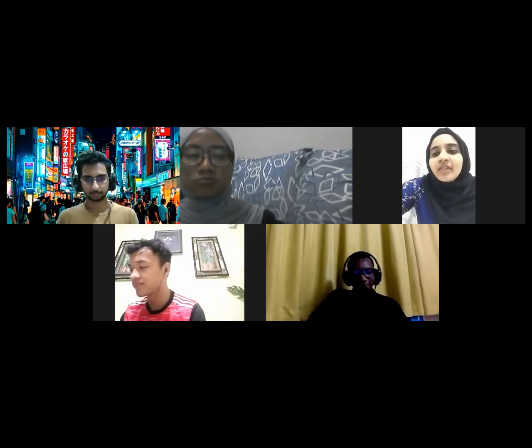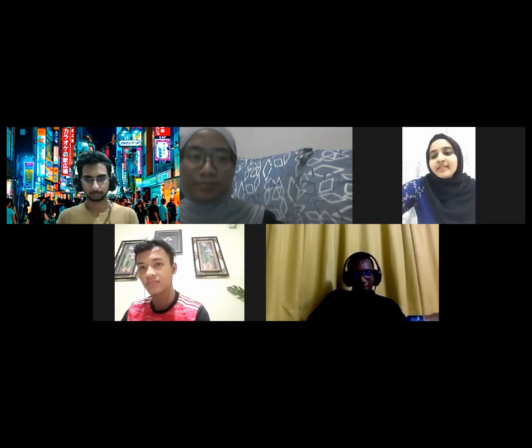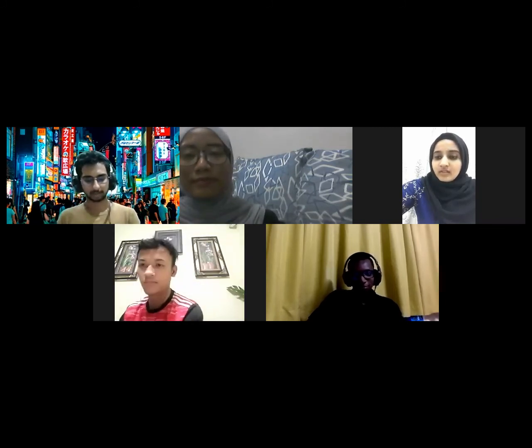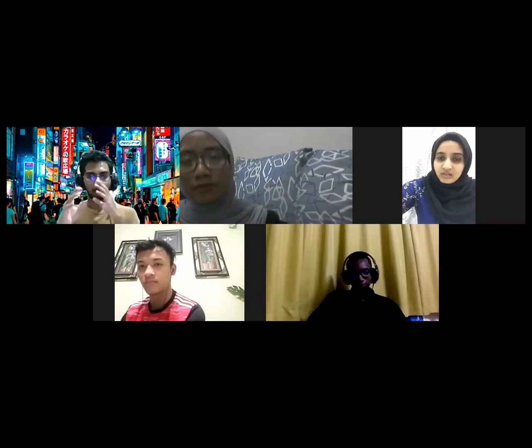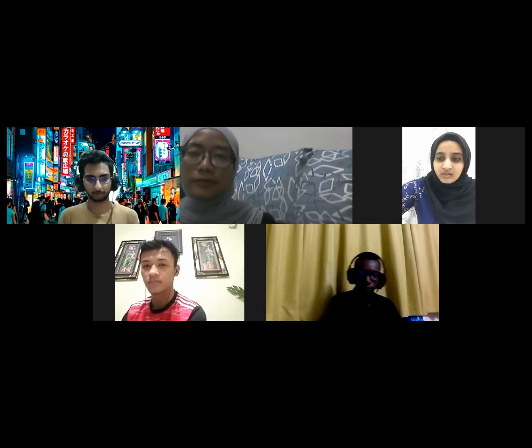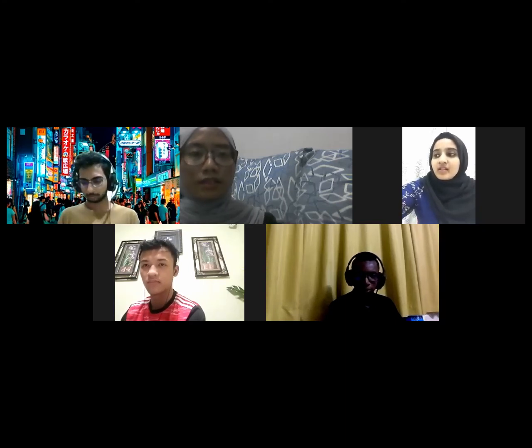I think all of us have to find better primers with better properties. I think we need to maybe refer back and ask some people, because we already found our primers. We just need a bit of adjusting on the primers. And maybe we can try Ashraf's method on how we can add. Ashraf can explain his method.